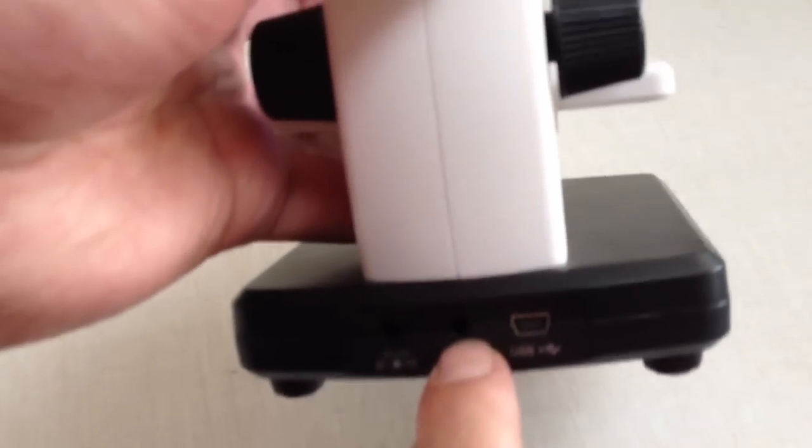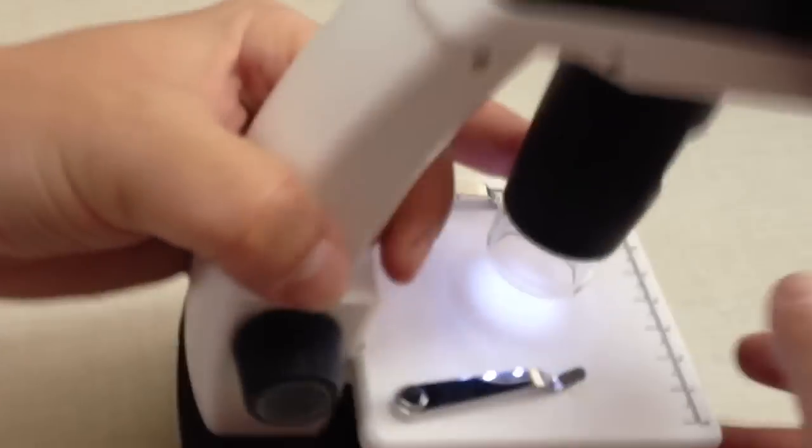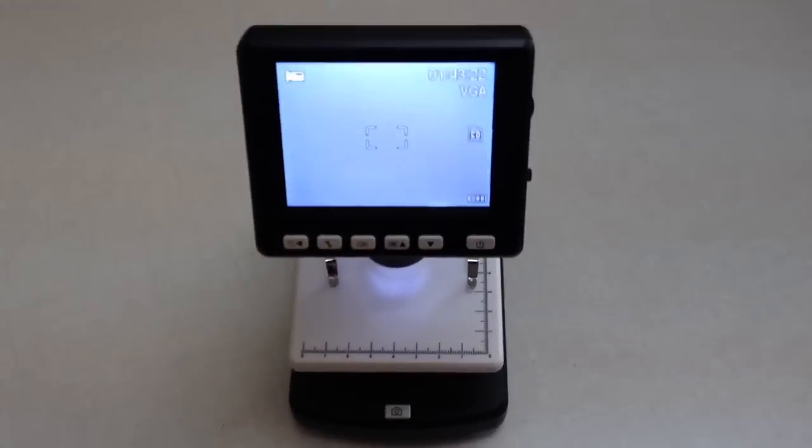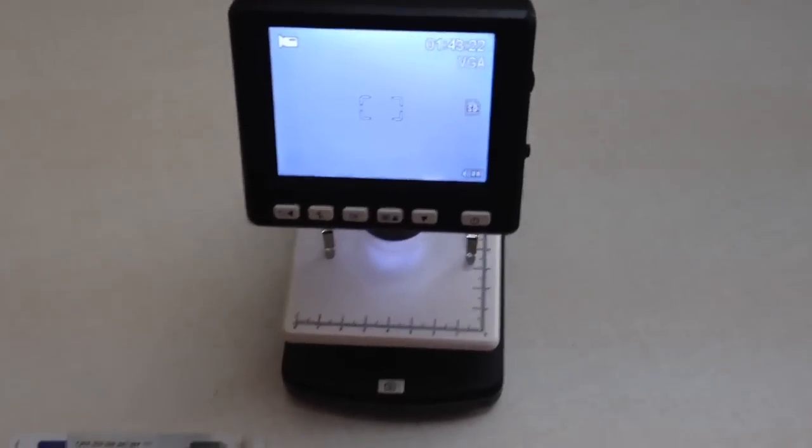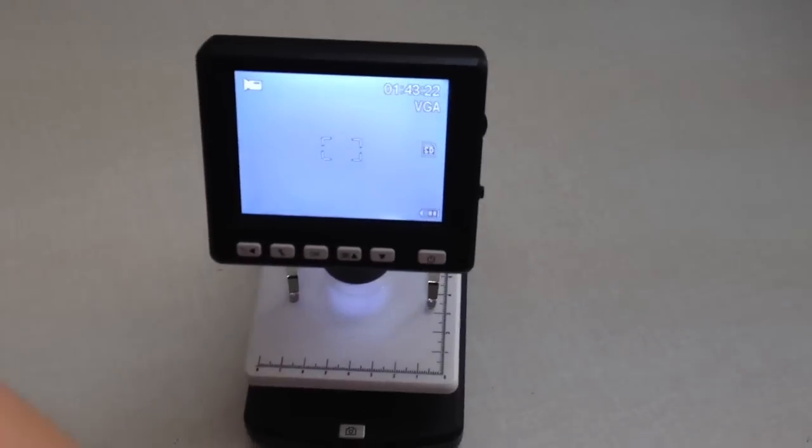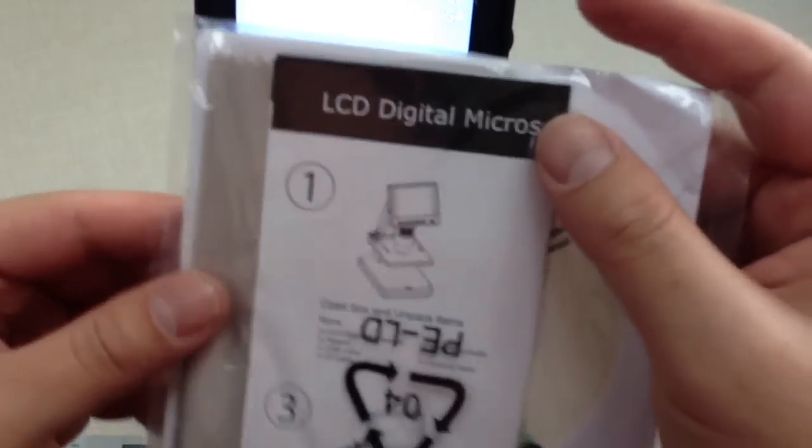It also has USB output. We can provide a CD with built-in machine software.